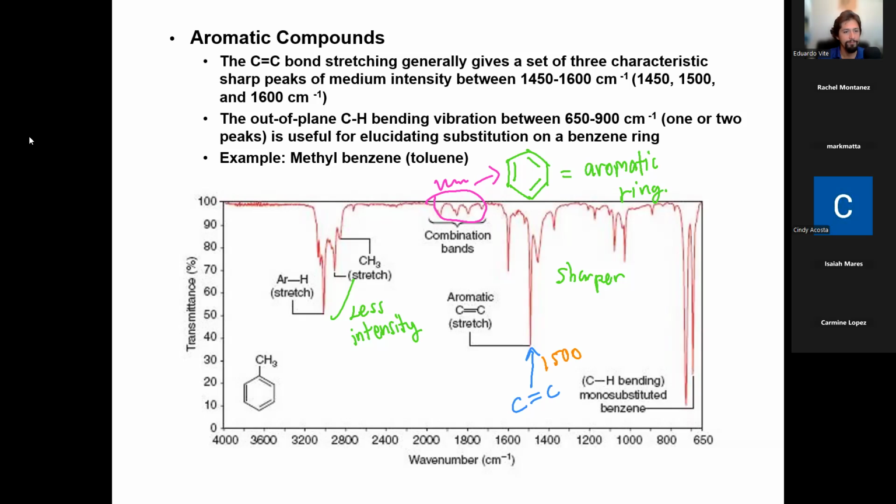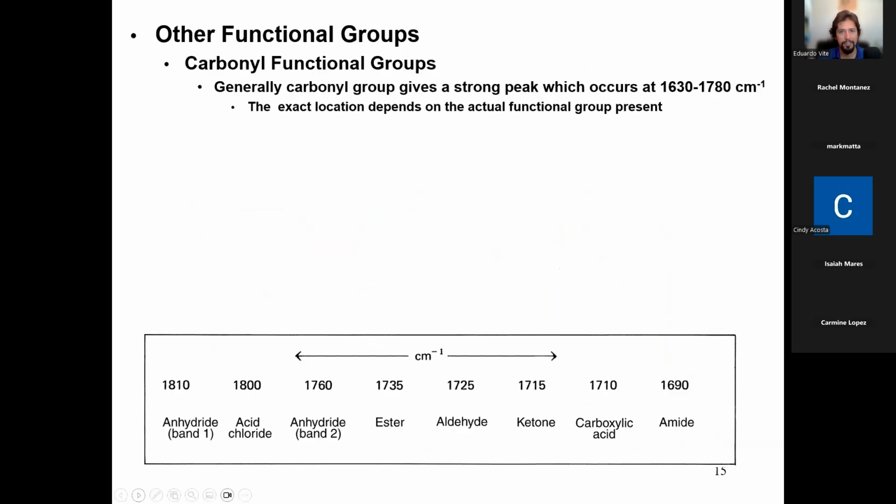All right, so next one. This is a big one, guys. If you learn nothing else today, if you forget everything about IR, at least remember this. You remember that meme from biology, right? The mitochondria is the powerhouse of the cell. You remember that. For organic chemistry, remember the carbonyl. Remember what the carbonyl is.